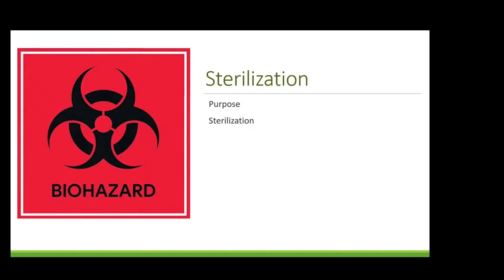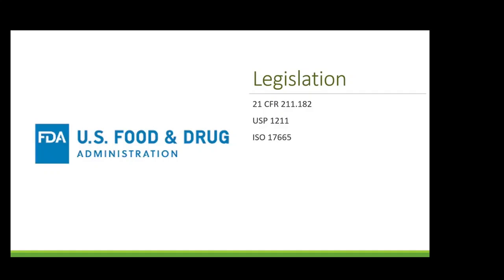Sterilization is the process of making something free of bacteria or other living organisms. Autoclaves are used to sterilize media and waste to ensure that there is nothing present before an experiment or disposal. The issue of sterility caused FDA officials to put forth the concept of validation in 1979.